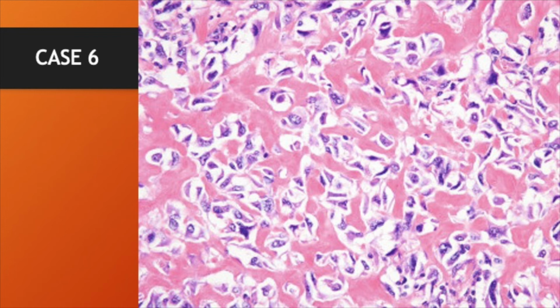So here's where it becomes difficult, where there's no obvious definition of where we draw the line between lace-like and ribbon-like and sheet-like. So again, we talked about earlier what sheet-like protein might look like, which is the background of that hyaline cartilage, where it's just wall-to-wall protein and there's no obvious filaments and the cells are just kind of stuck in there. And that's not what we have here. So we're either in the islands or lace-like osteoid.